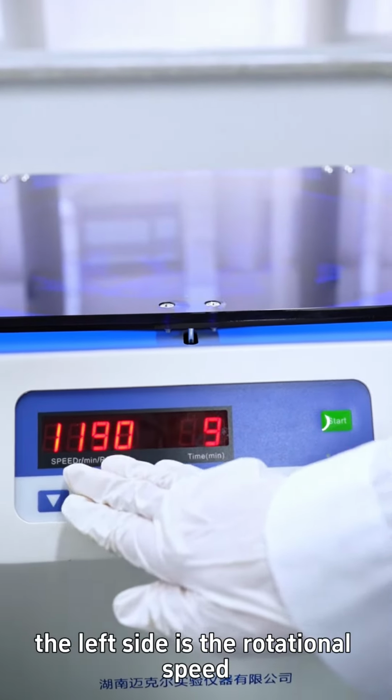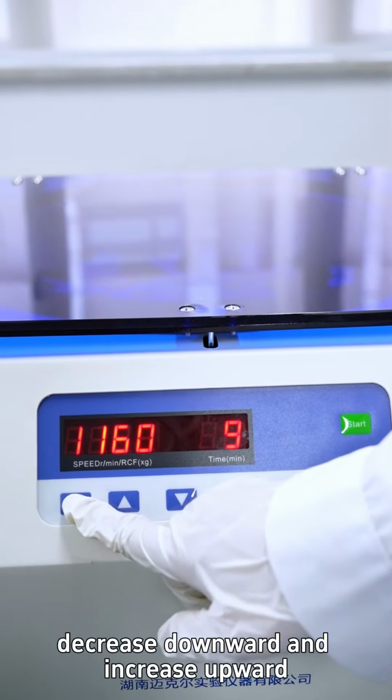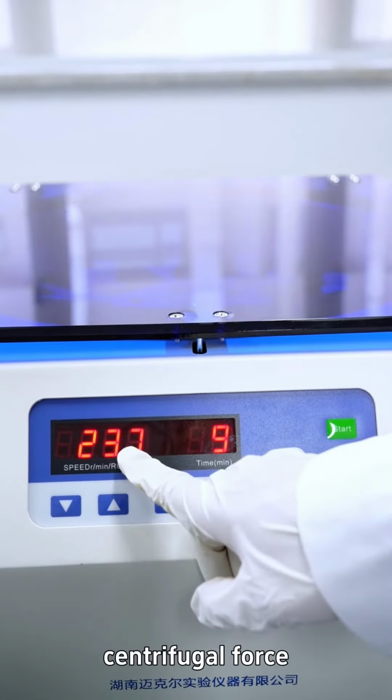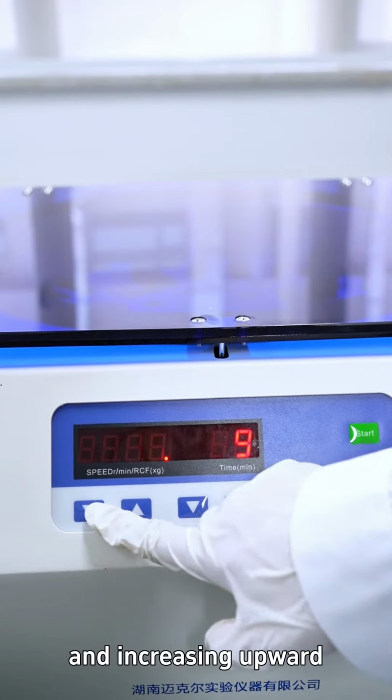The left side is the rotational speed. On the right is the centrifugal time. Decrease downward and increase upward at the bottom. Pressing the changeover button displays the centrifugal force. The force is also increased by decreasing downward and increasing upward.